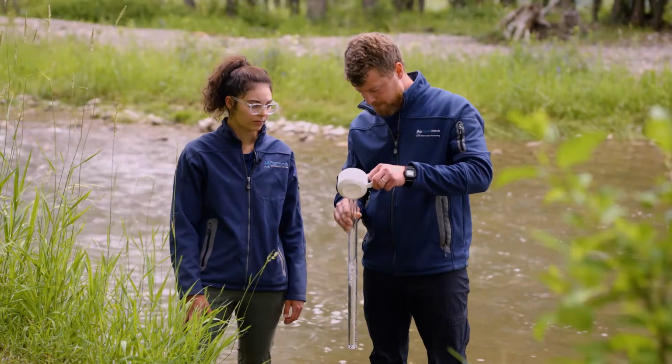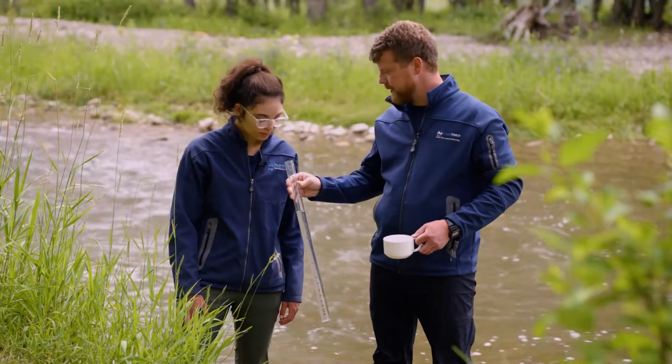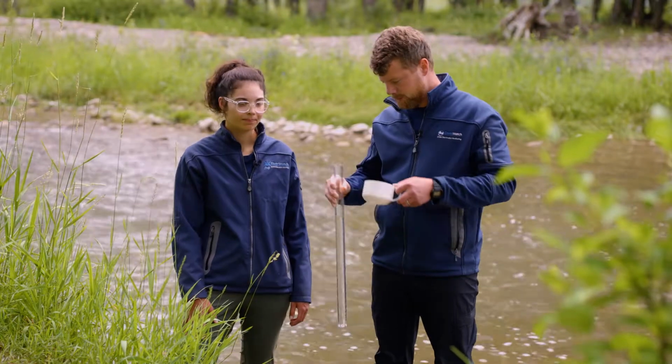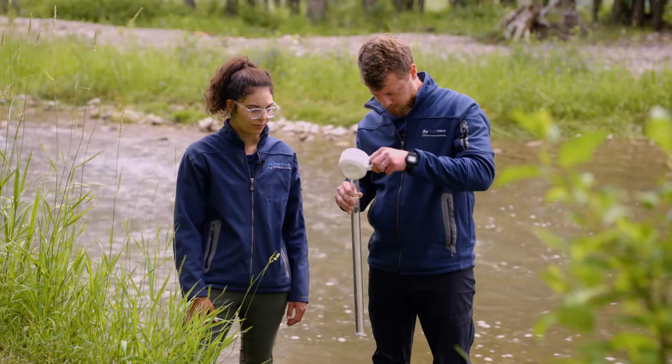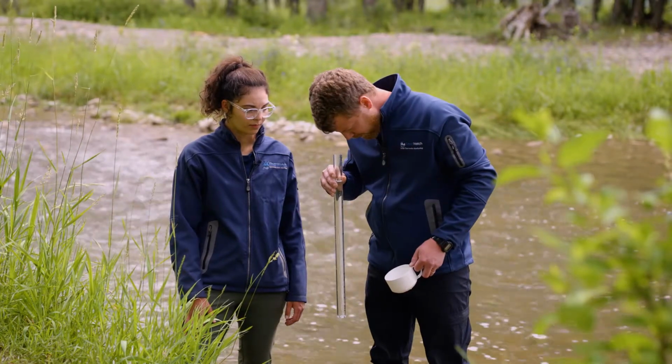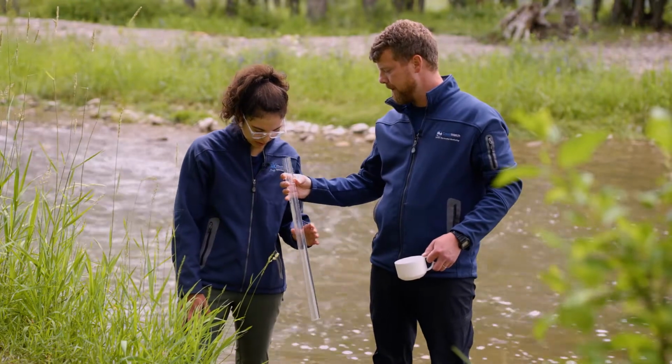All right. Yeah, I can still see them there as well. I can still see them. All right. Oh, and I think they've just disappeared right there. Yep, I no longer see them.